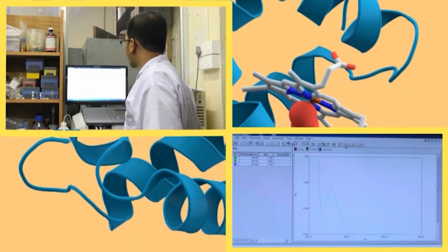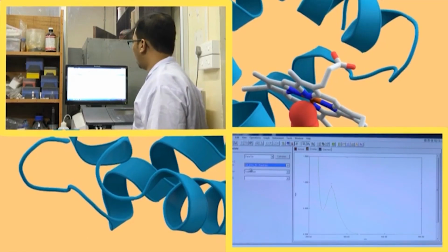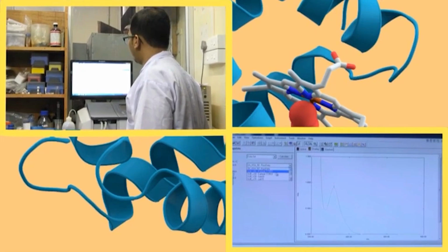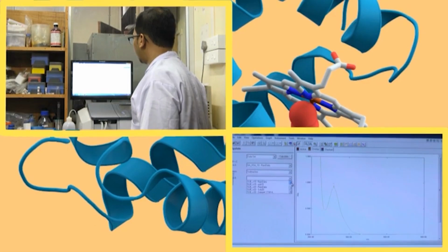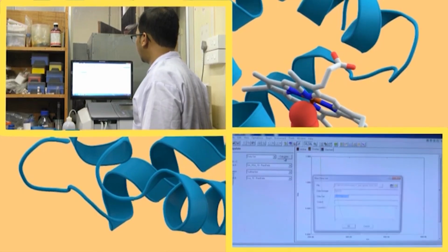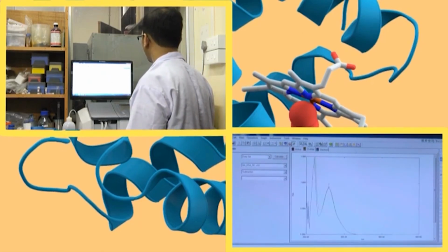So, again for the subtraction we will go to this manipulate option, we will select data set, already subtraction operation is activated. From there we will select GA HSA 10 and subtract it from our HSA 10, which is somewhere out there. It's a 20, okay. So, we have to search it properly. So, HSA 10, calculating it. Okay, so it is coming.